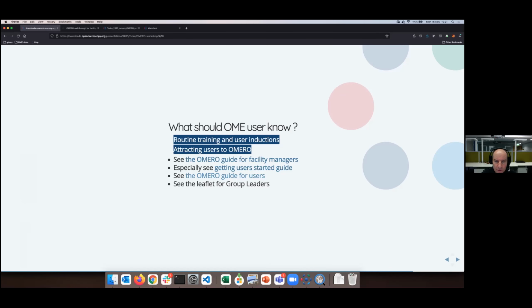By the way, you can do that as well. I will show you in a second where this presentation really is. Actually, Jean-Marie can start pinging the link to the chat. Excellent, thank you very much. So the presentation is not going to go anywhere. What I'm showing you here is going to stay there forever, for you to peruse even after the workshop. You can navigate to the presentation and go through the slides as I'm doing, on your computer right now. Okay, and click on those links and get yourself wise about OMERO.